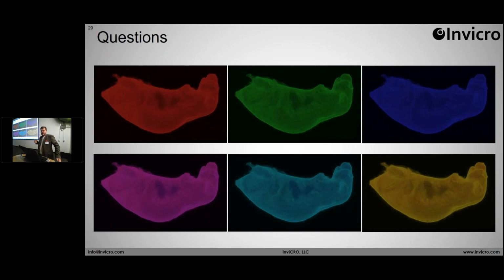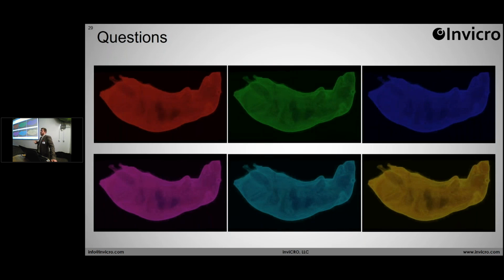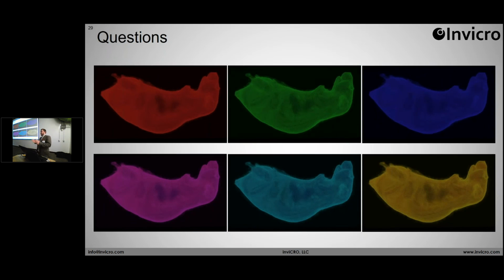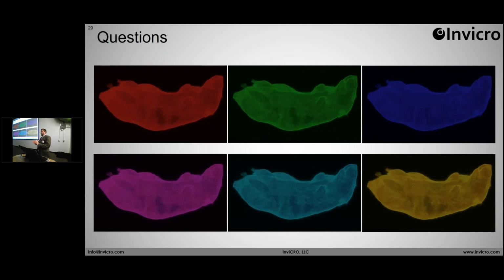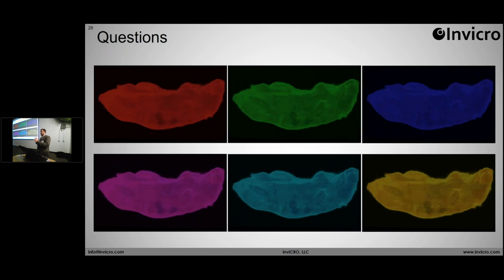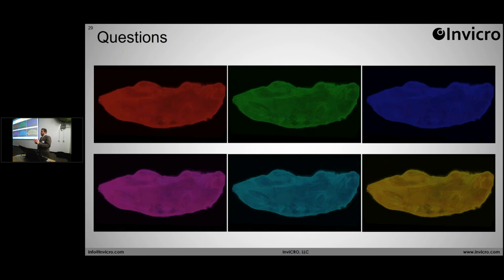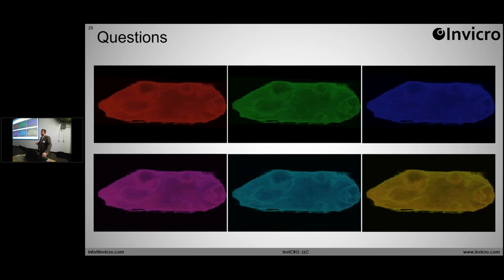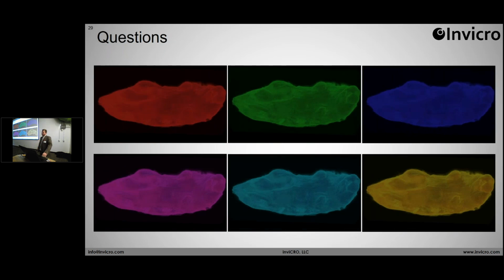The answer to that is, based on our instrumentation, that technology is still fairly young, but we can do it. The imaging is done by notch filtering. So if we have a reference channel and an active channel, say we have a GFP and then either a red channel or a blue channel image that can be a surrogate for the autofluorescence, then yes, we can do spectral unmixing to remove that. But do we have hyperspectral techniques to do multifluorophore spectral decomposition? We're not quite there yet, but hopefully someday we will be.